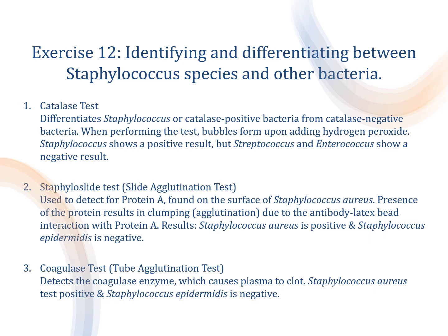When the bacteria is added to the slide, the antigen, which is protein A, attaches to the antibody and causes agglutination, which is just clumping. If you remember from the lab, the part with Staphylococcus aureus had blue clumps in it. The part with Staphylococcus epidermidis didn't have any.